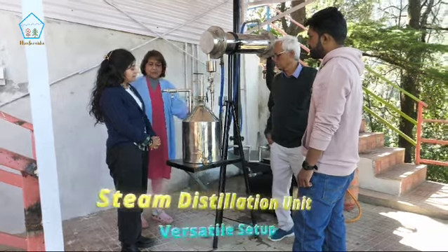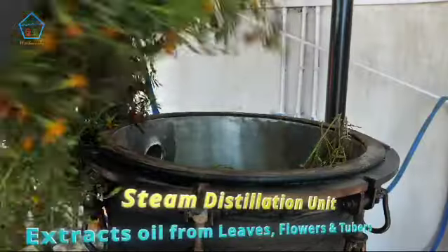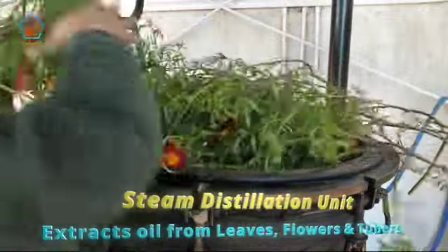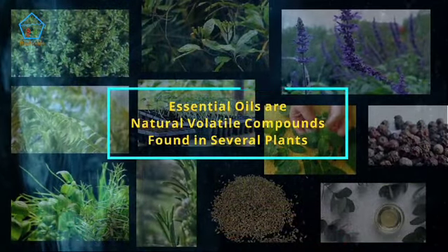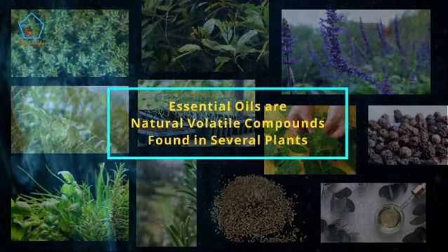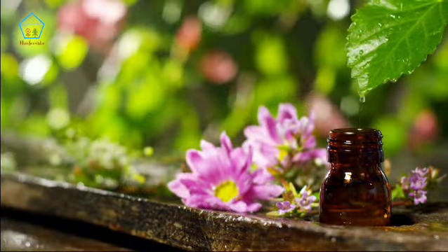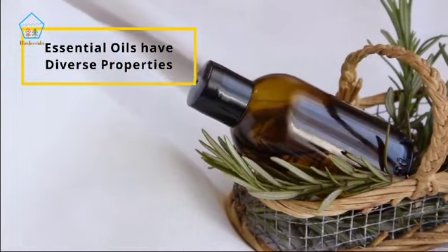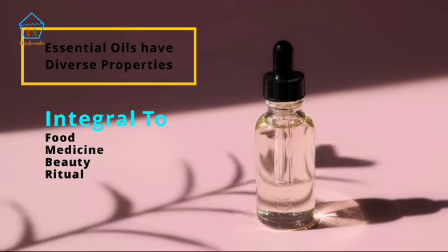The steam distillation unit is a versatile one. It can extract essential oils from leaves, flowers, and tubers. Essential oils are natural volatile compounds found in several plants. With their diverse properties, these oils are integral to food, medicine, beauty, and ritual.